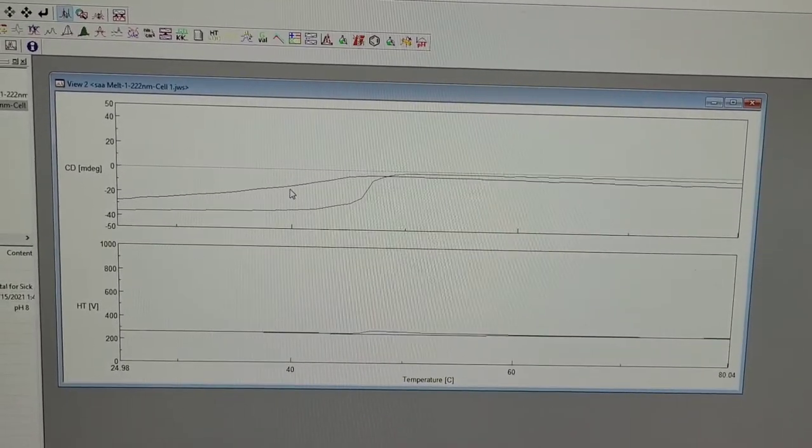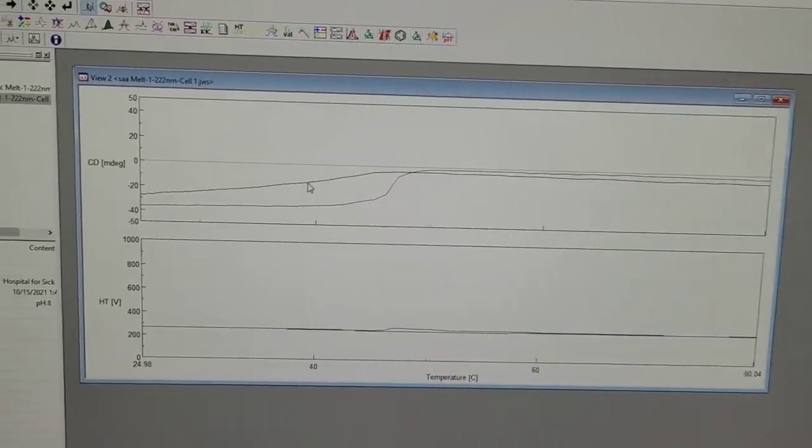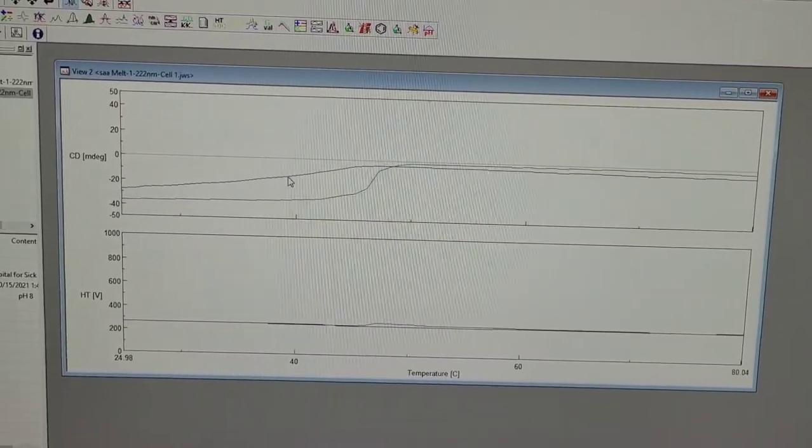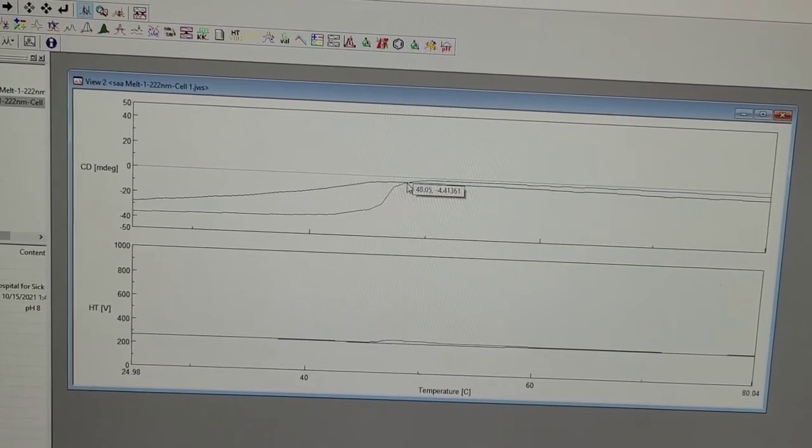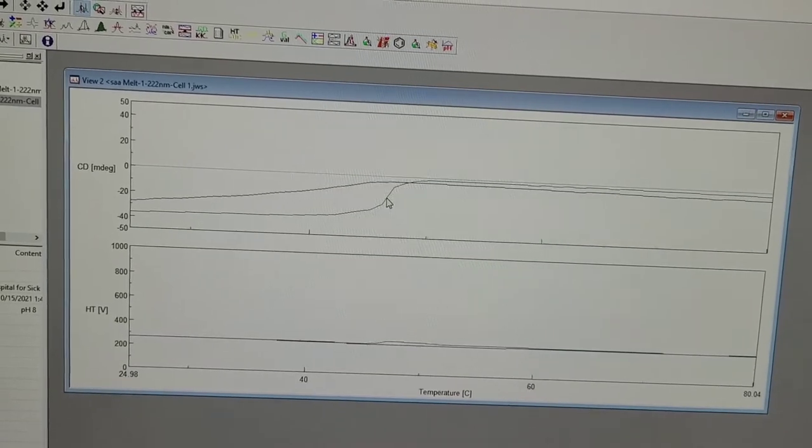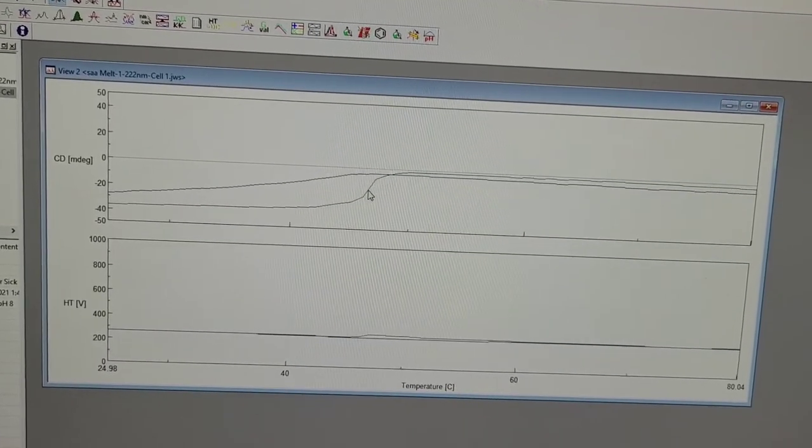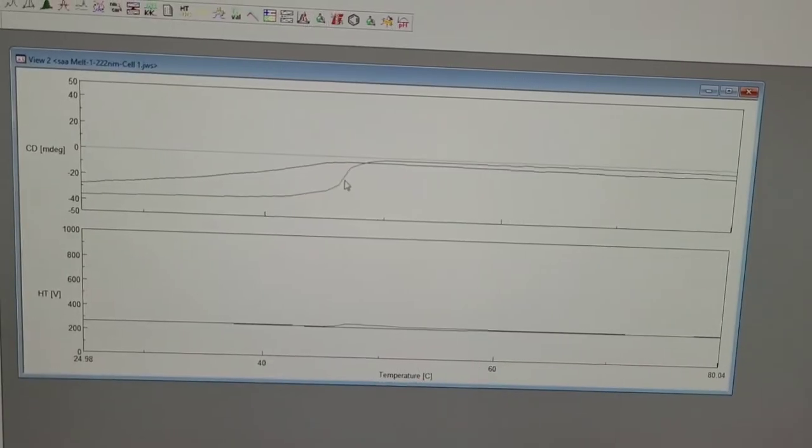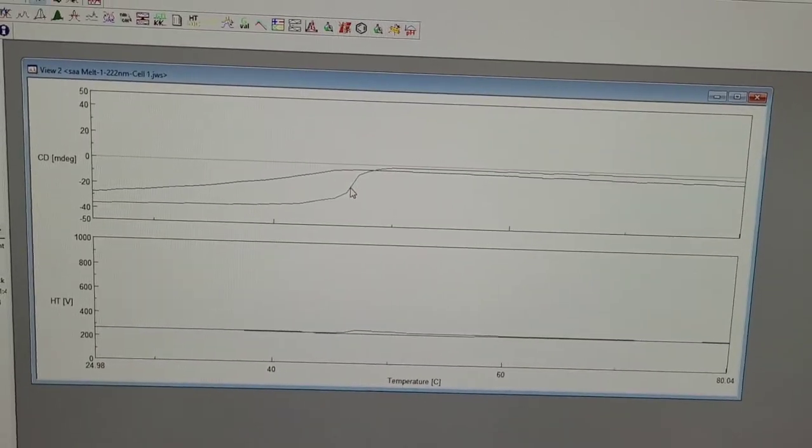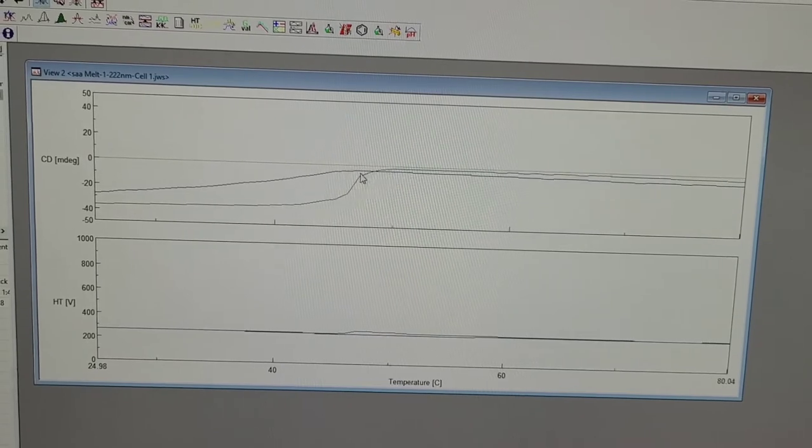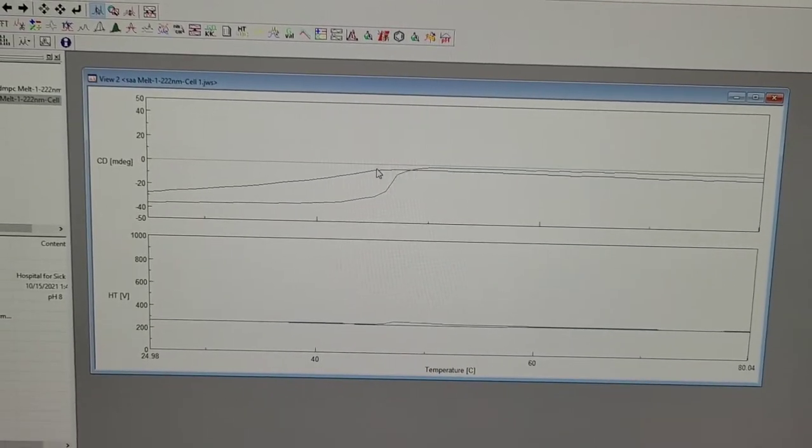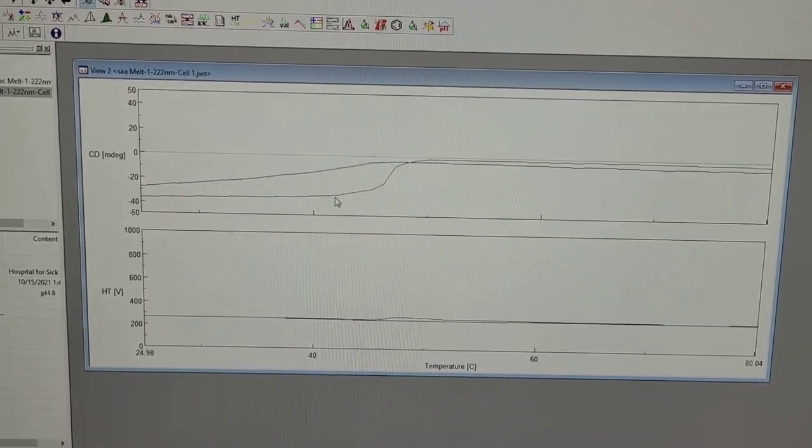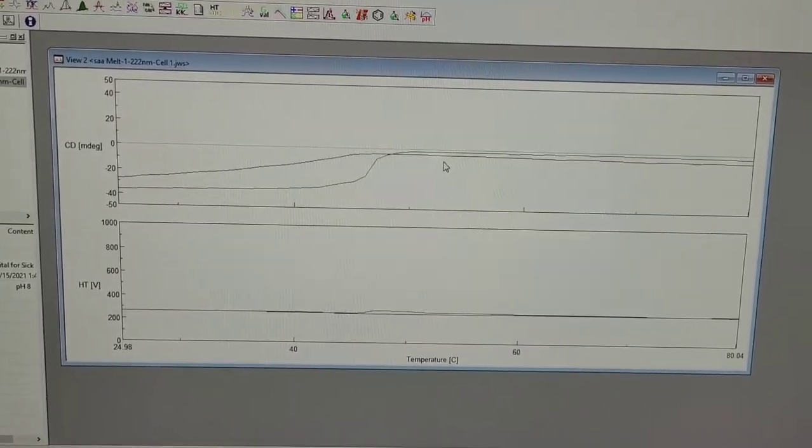But in the presence of lipid, it will increase up to about 45 degrees, a little bit more. And you can see also the way it's ramping is very gradual for the lipid free form, but in the presence of lipid, it is very sharp.